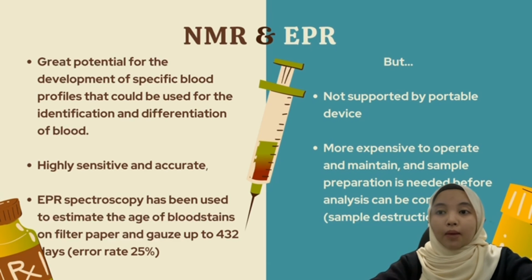This means that NMR and EPR samples may not be appropriate for downstream analysis such as DNA analysis. These techniques are highly sensitive and accurate, but because of the limitations associated with this method, not many studies have been performed.